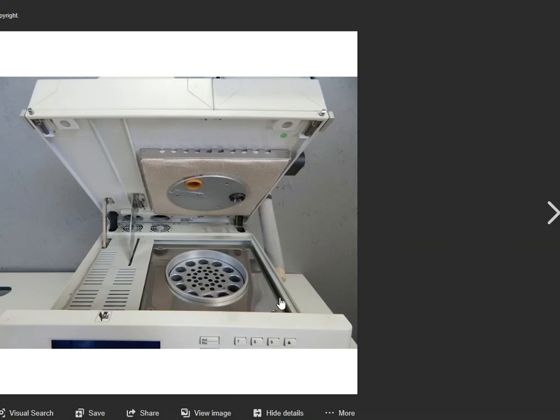If we open up the top of the box, I told you it opens up like a car hood, right? So here's the digital readout, and here's the keypad on the front of the machine. You see that there at the bottom. The only thing you have to do is push the buttons on the side, and this thing pops open, and you can see the valve entry ports here.